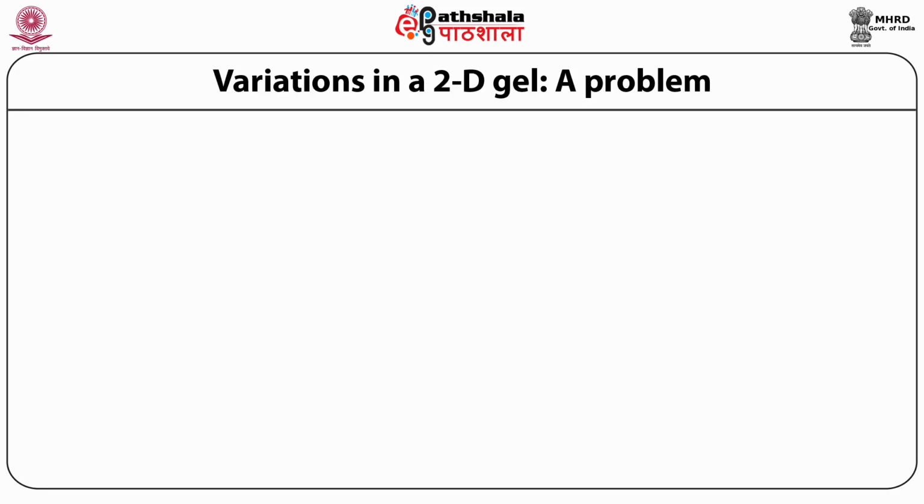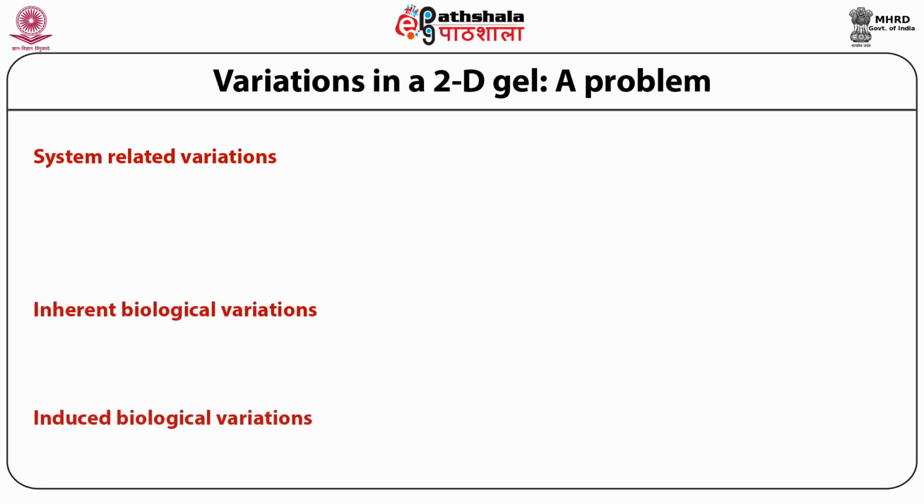The problem could arise because of system-related variations, inherent biological variations, or induced biological variations. Just have a glance at some of the aspects of these variations.